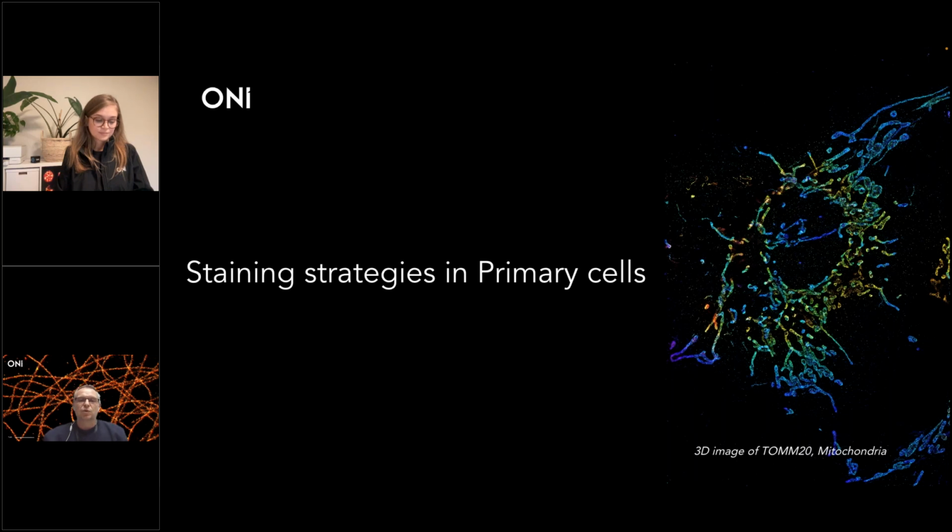You permeabilize, or you don't permeabilize if you're interested in the outside membrane or the external part of your protein. And then you use the antibody for staining. When you optimize that, and you are 100% happy with it using controls and all around, then I would use the same strategy for labeling on my precious sample, on my sample which is coming from primary cells.